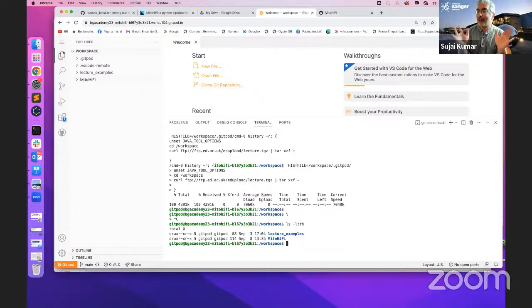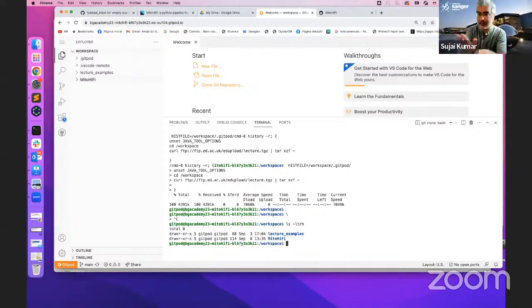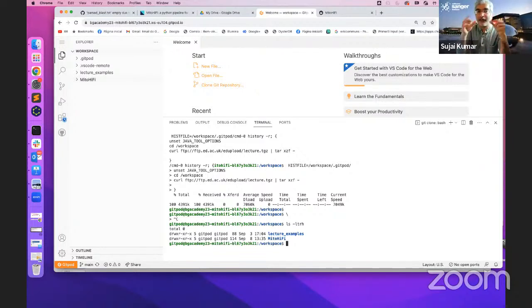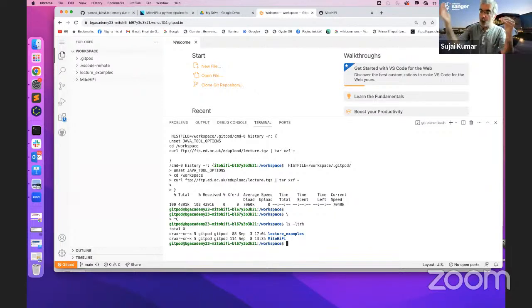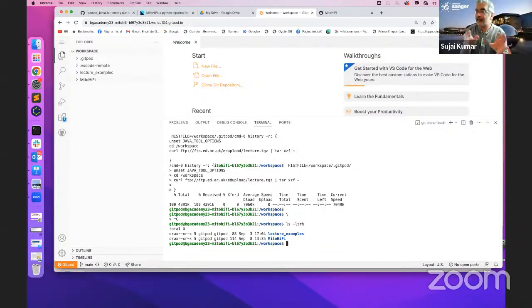GitPod sometimes takes a few seconds to fire up a workspace. Other people may be fast, yours might be slow because GitPod has a certain number of machines and if requests increase, it has to start a new machine. Usually within 30 seconds to a minute everything should be done.